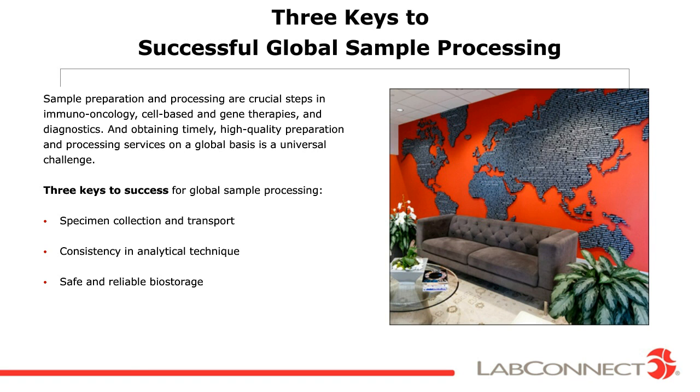Today, we're going to discuss 3 keys that we feel contribute to the success of global sample processing. These are going to include specimen collection and transport, consistency in analytical technique, and safe and reliable biostorage strategies.